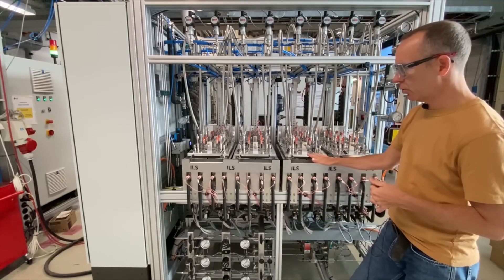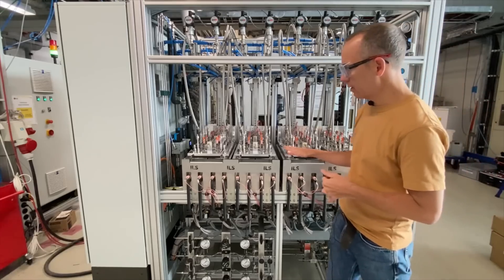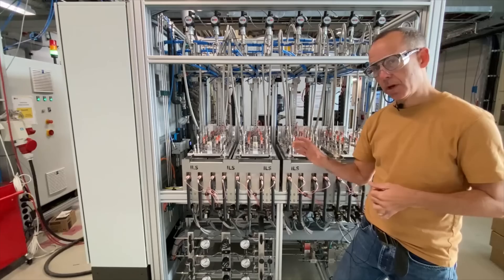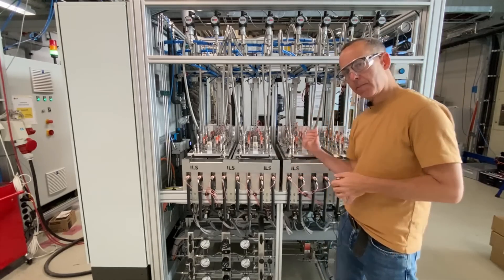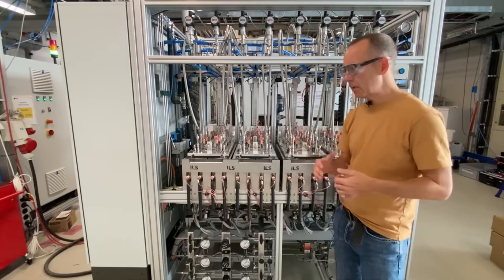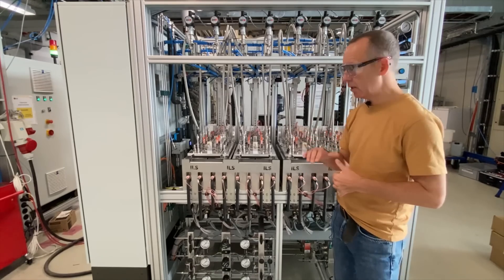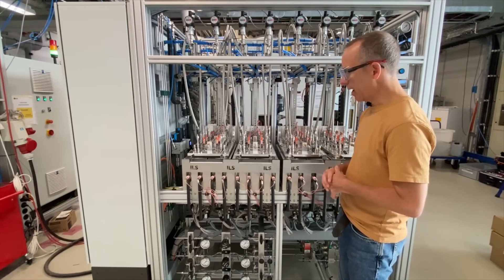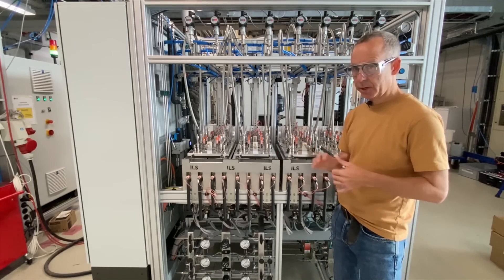This unit has been made to go to 200 degrees and 200 bars. We have reactors in temperature blocks containing two reactors per temperature block, so that means we can operate at the same time at 16 different temperatures, which is really helpful for screening or basic kinetic work, deriving our Arrhenius plot fairly quickly. The 200 bars gives the client a lot of flexibility in terms of the pressure range they can operate at.